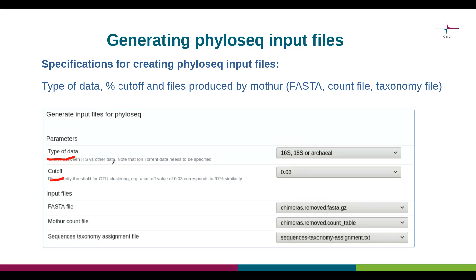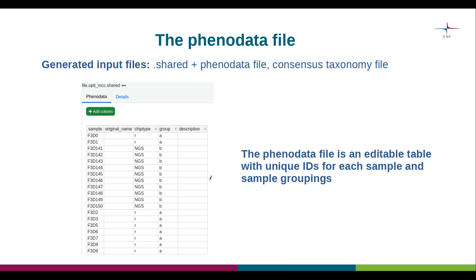The cutoff value corresponds to the percent dissimilarity threshold used for OTU clustering. For example, a cutoff value of 0.03 stands for 3% dissimilarity or 97% similarity, which is often used as a threshold for OTU clustering. We also have to specify three input files: a FASTA file with sequences following chimera removal, a count table file, and a sequence taxonomy assignment file. Running the generate input files for PhyloSeq tool produces a number of files: a shared file associated with a phenotype data file, and a consensus taxonomy file.